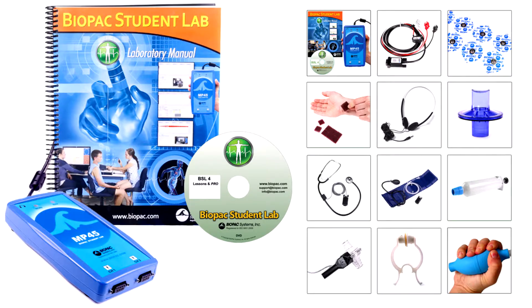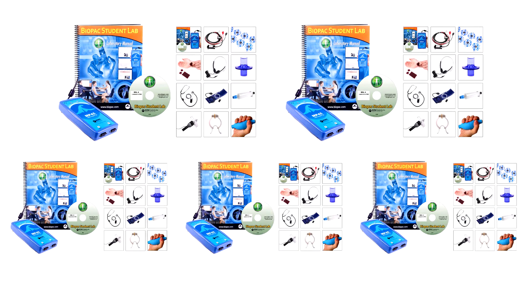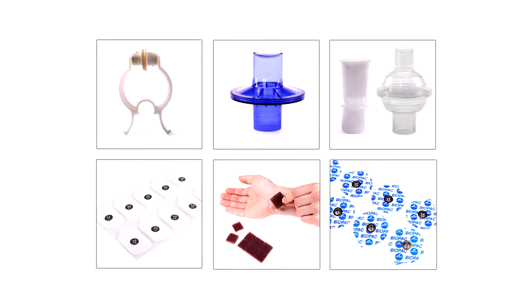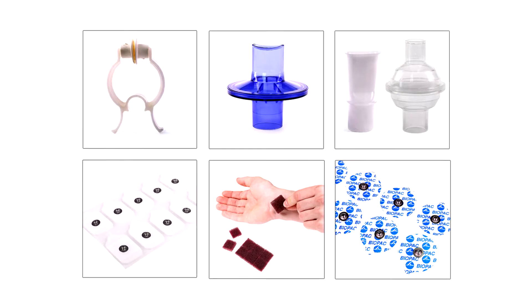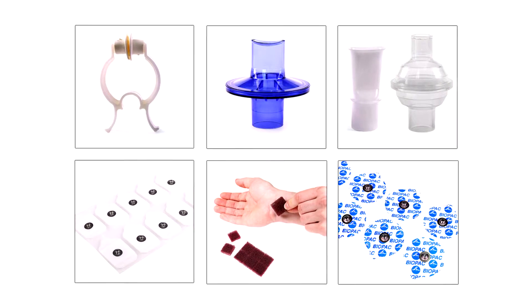Both options are available as single systems or in five-system multi-packs for a complete classroom setup. You can also add the BSL accessory pack to any system — bookstores can stock them to reduce your budget and make students accountable for their own consumable items.